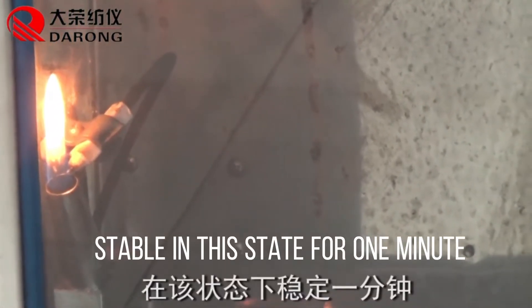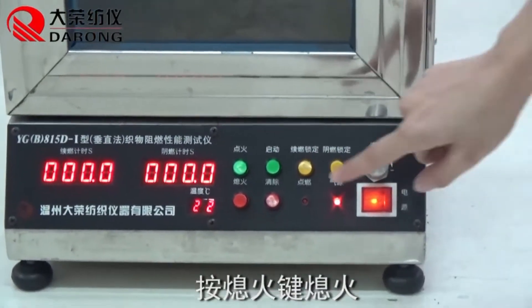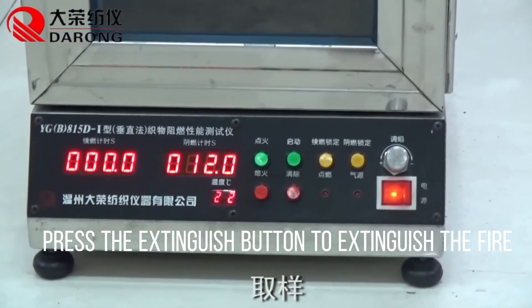Stable in this state for one minute. Then press the extinguish button to extinguish the fire.